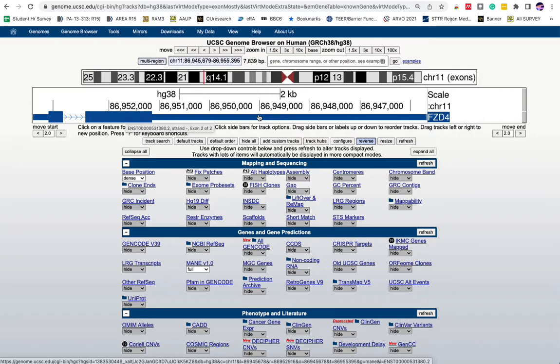You can actually, while you're here, hit on your keyboard the letter E first, let go, and then hit V. I'm going to hit E and then V, and that's already put it in this format anyway. I might already be in this format. It will create this exon format for you.